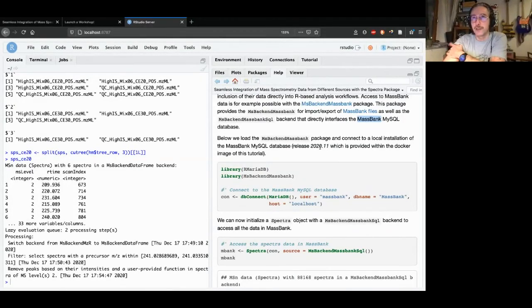But for sure, once I get a little more time, I will work on that, because the long-term goal is, as I'm mostly using XCMS for untargeted metabolomics data processing, to use the Spectra object as well as the chromatograms object for XCMS. The chromatograms would represent the extracted ion chromatograms for the ions, and the spectra would cover all the other things.